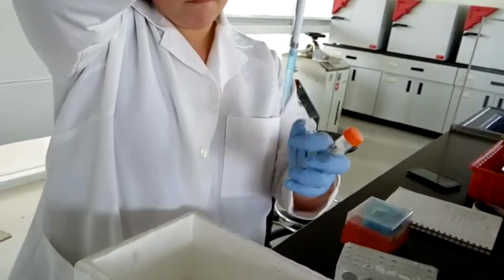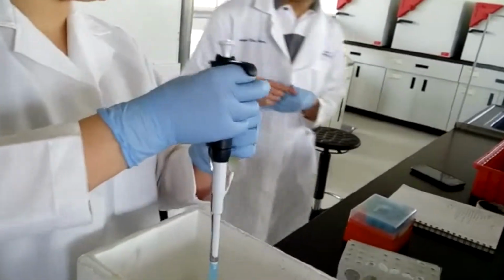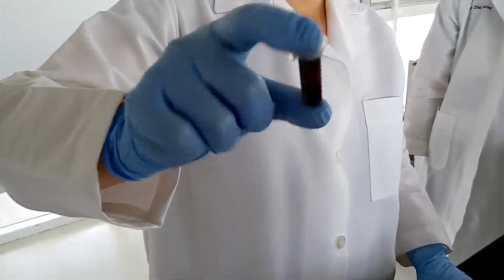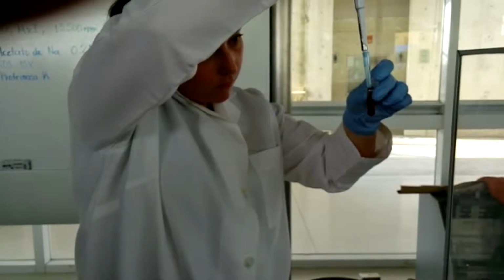Finally, the purification. Since the DNA does not dissolve in alcohol, we can use cold ethanol and recover the genetic material by centrifugation. The next step consists of recovering the pellet, which contains DNA, and it can be suspended in water for conservation. There are several differences between RNA and DNA extraction.